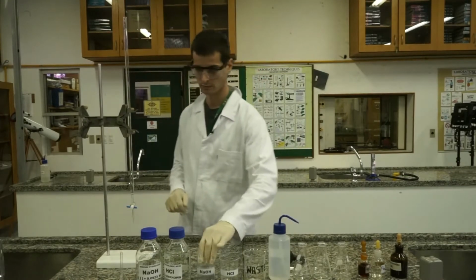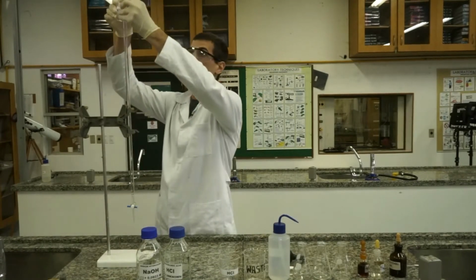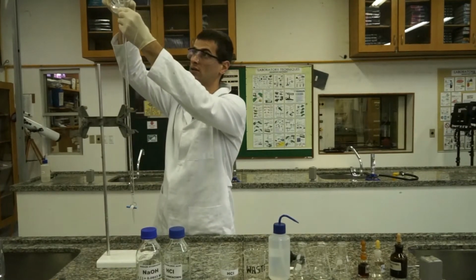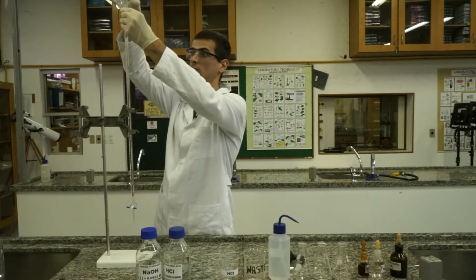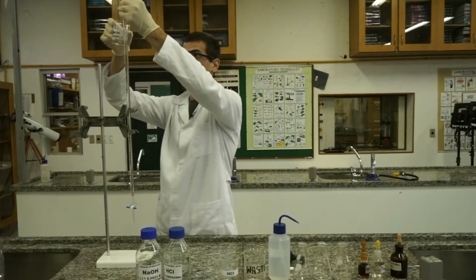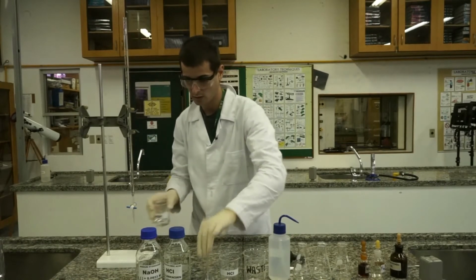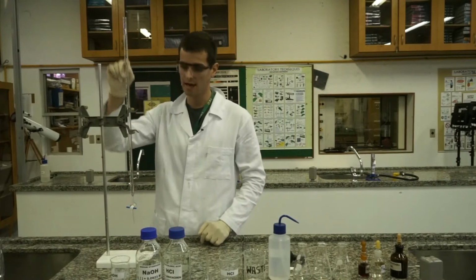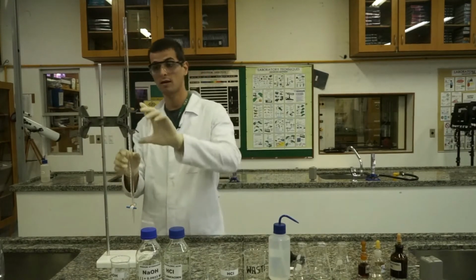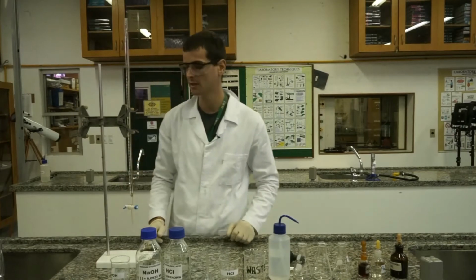Now I'm going to fill the burette with sodium hydroxide, the TITRANT, above the 0 mark. Note that the markings on the burette go from lowest at the top to highest at the bottom. And this burette holds 50 milliliters.